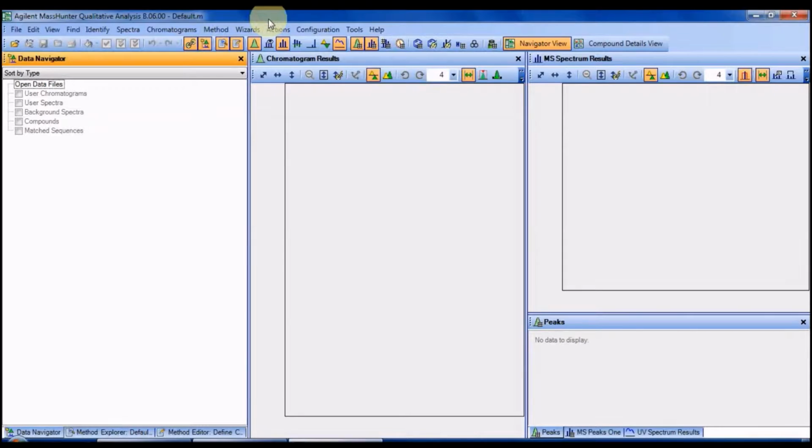The next important parameter is the product ion for the SRM transition. The product ion should first provide high sensitivity, that is, it should be abundant. Second, it should provide high selectivity, so it should be as discriminating as possible. Thus, ions with high m/z and originating from less common fragmentation pathways are preferred.